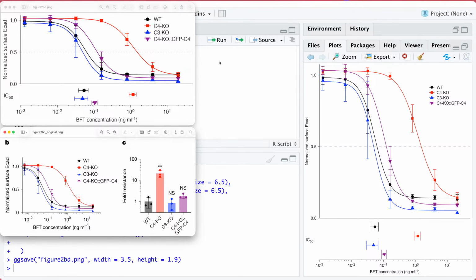Another way, Mark says, another way to show is the confidence of the cloud of the line of best fit. Yeah, so the problem with geom_smooth is that it won't show the standard error for the NLS model. There are certainly ways that you could incorporate that to show the model.